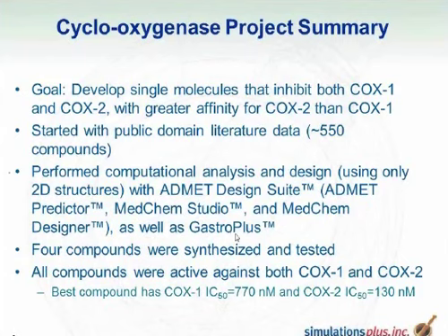We've synthesized 4 molecules so far and tested them. All compounds show activity against both COX-1 and COX-2. The best compound had a COX-1 IC50 of 770 nanomolar and a COX-2 IC50 of 130 nanomolar.